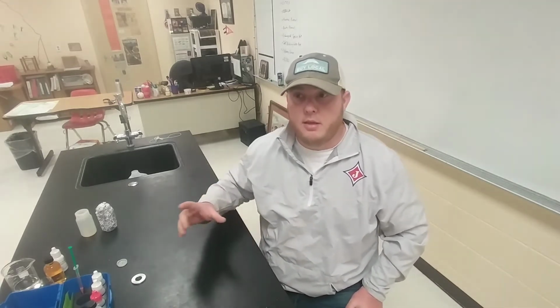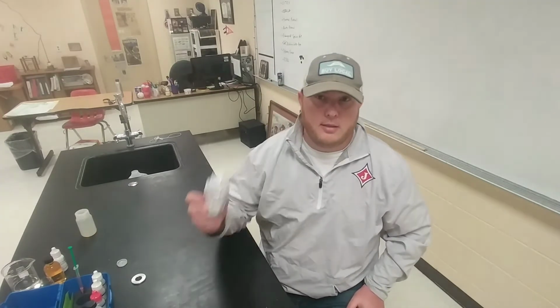So now it's time to test the BOD, or biochemical oxygen demand. BOD is just a measure of how much organic matter you have inside of a sample of water. The way we test that is we compare the dissolved oxygen content as it first came out of the stream with the dissolved oxygen content 5 days after, with no opportunity for photosynthesis.